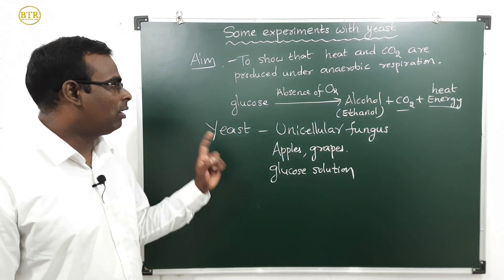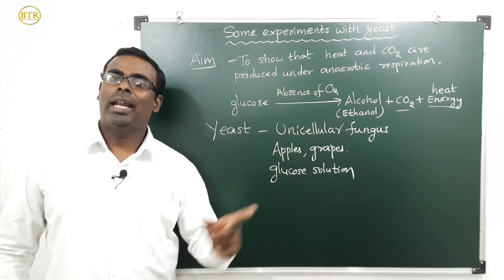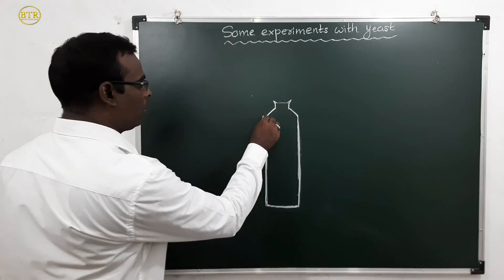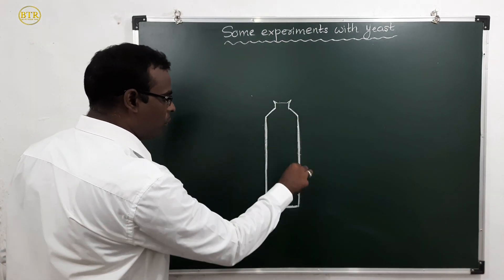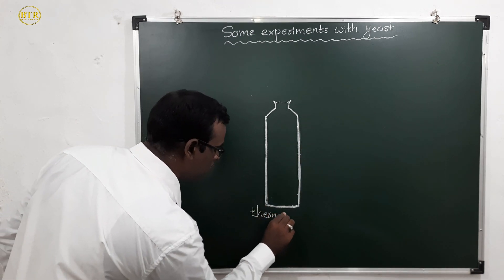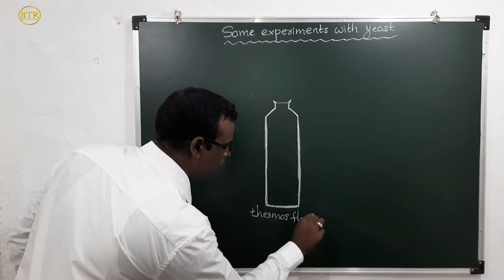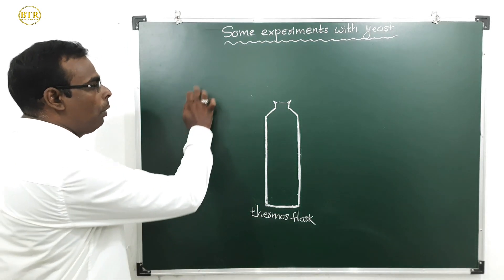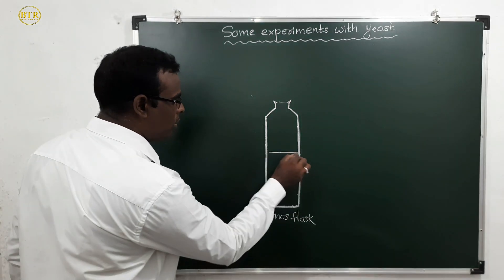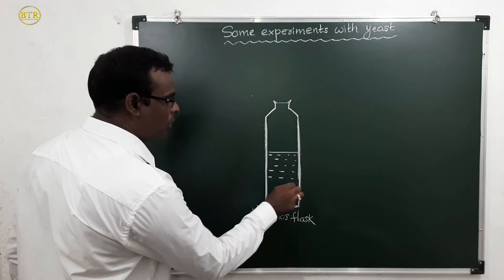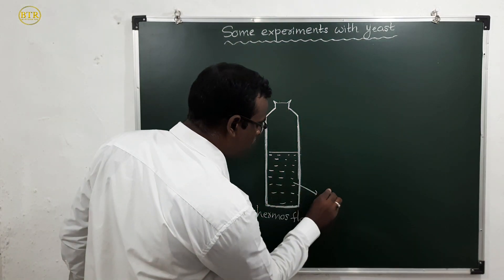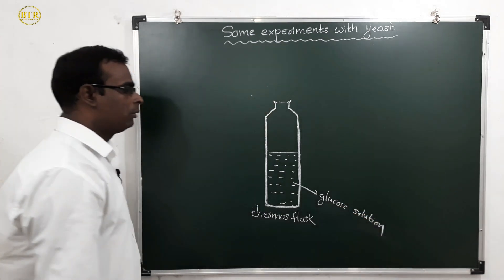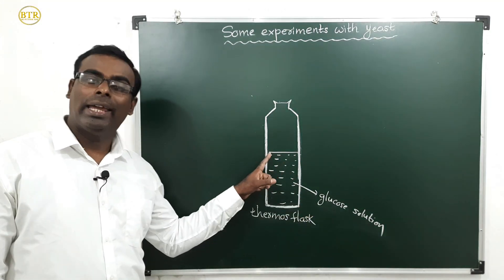With the help of yeast, we are now going to prove anaerobic respiration. Let us start our activity. We take a thermos flask and pour the glucose solution into it.